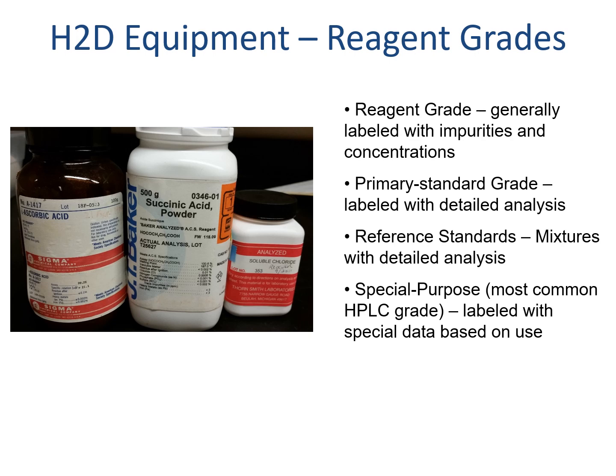For many types of instrumental analysis, reference standards are used, sometimes with mixtures that allow for internally calibrating an instrument at multiple signal locations, like several wavelengths for calibrating with several elements. There are also special purpose reagent grades that often have details appropriate for a specific use. For example, HPLC solvents are made to run on high performance liquid chromatographer instruments, or HPLCs, without impurities like water that would change the polarity of the solvent or impurities that would interfere with an instrument detector.